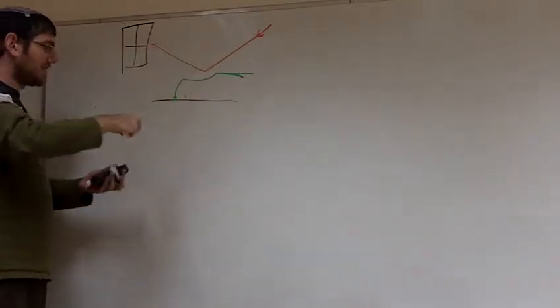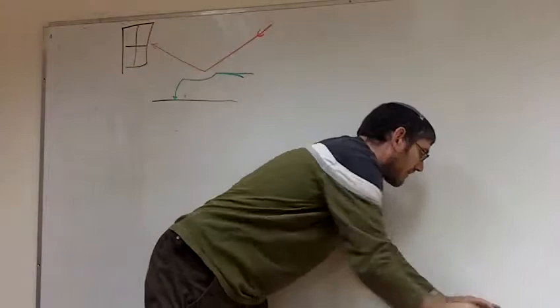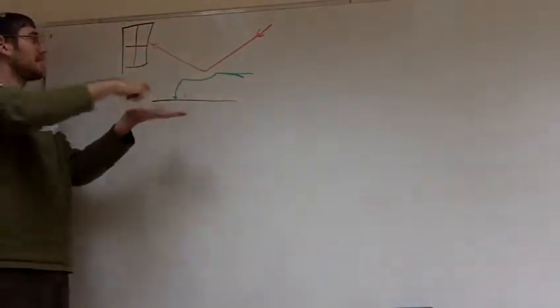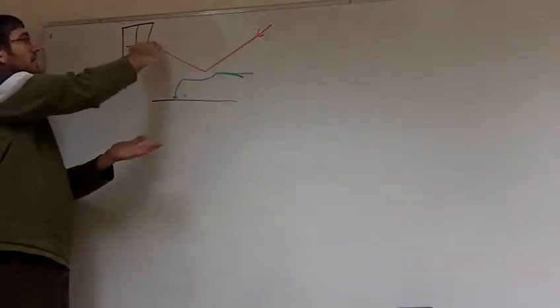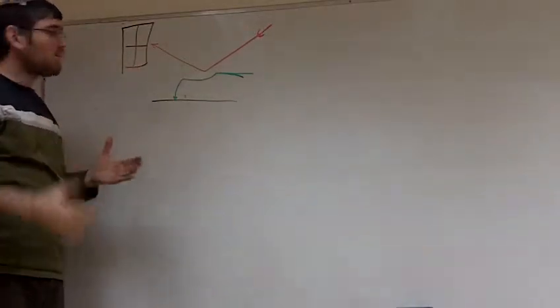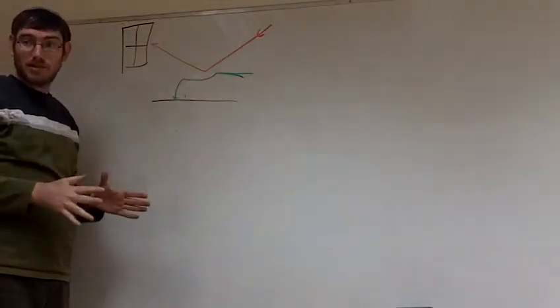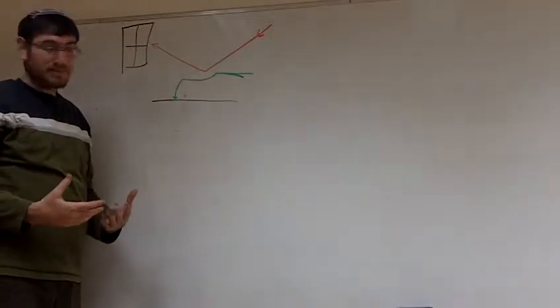So for example, if the tip is in contact with something high, it will deflect like this, and the laser will hit some area. If it's somewhere lower, the deflection will be, let's say, a little bit lower. So this is our feedback, our way to know what's going on with the tip. So that's the contact mode, that's the most basic mode. We have another mode, it's called the intermittent mode.